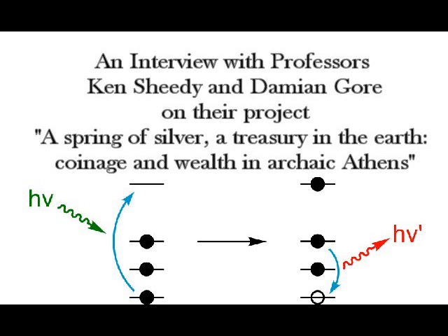We determined it was compositionally simple, relatively thin, unlike bronzes. So I wouldn't even attempt using XRF with bronze. I wouldn't use XRF with debased silver. What we did was we took these coins, analysed them through the patina, and then we abraded the patina off on one side and reanalyzed the coins. We analyzed the coins using 5 different techniques, and around 1,000 or just over 1,000 analyses for the 10 coins. And then we were able to convince ourselves and our colleagues that the method works reasonably well where you have relatively pure silver and a relatively thin patina.